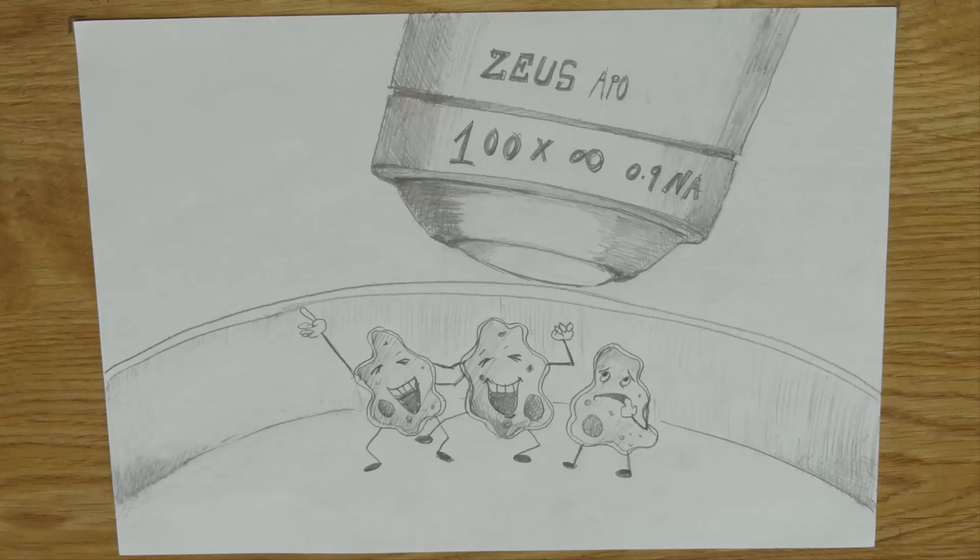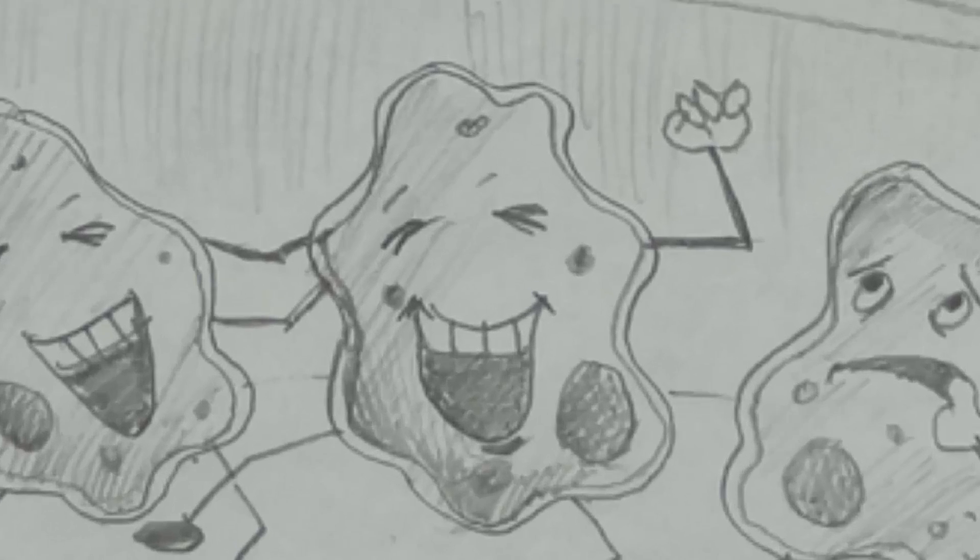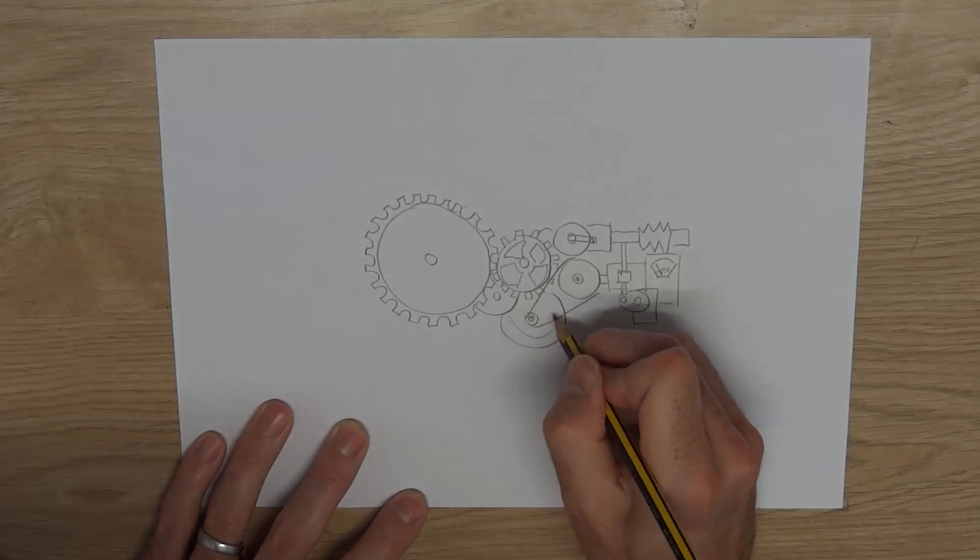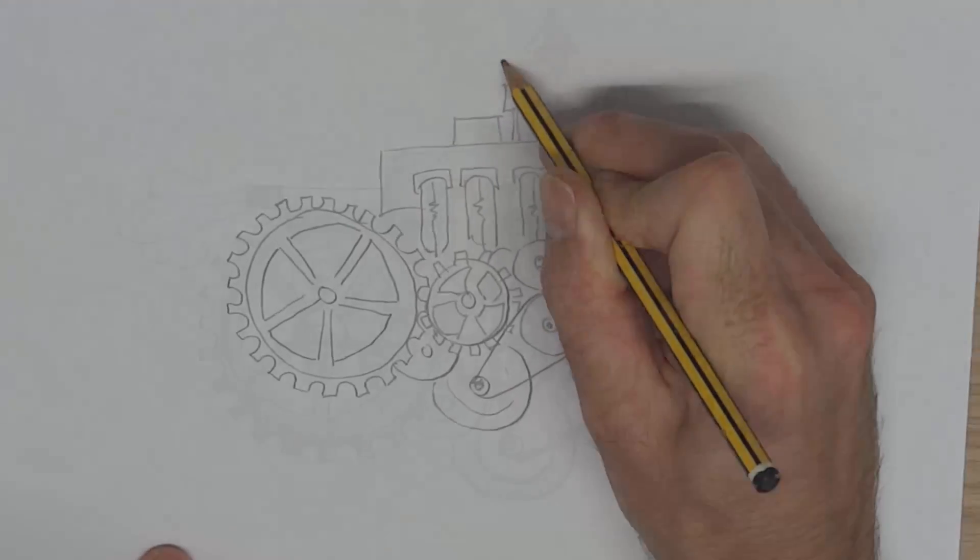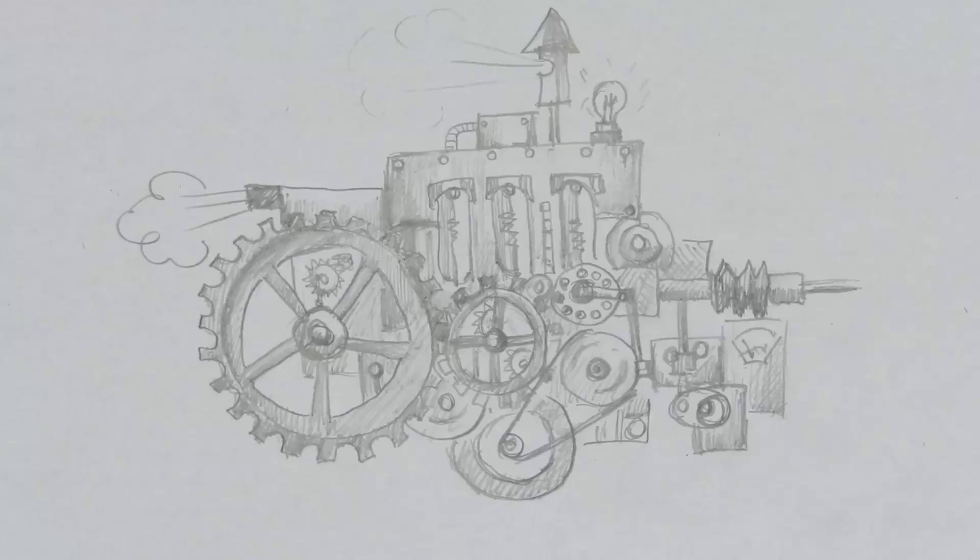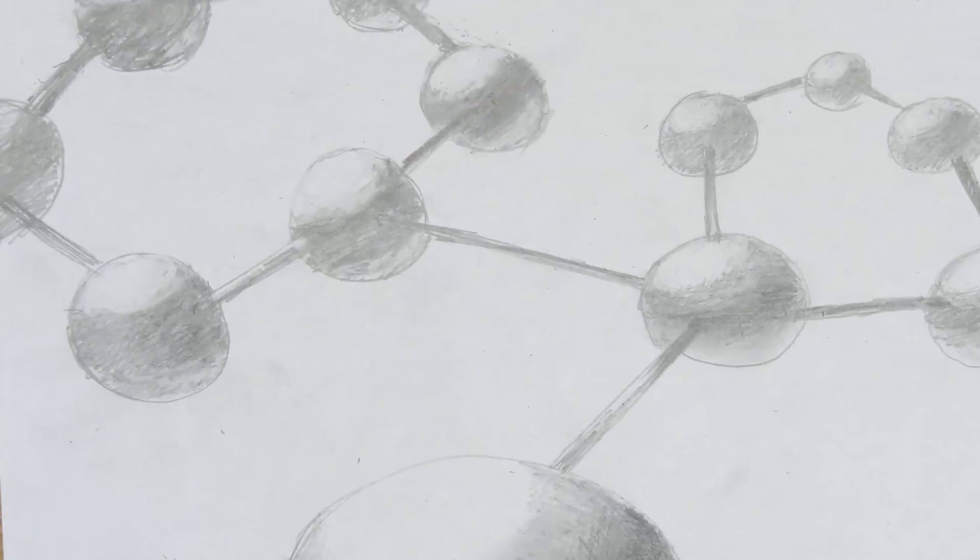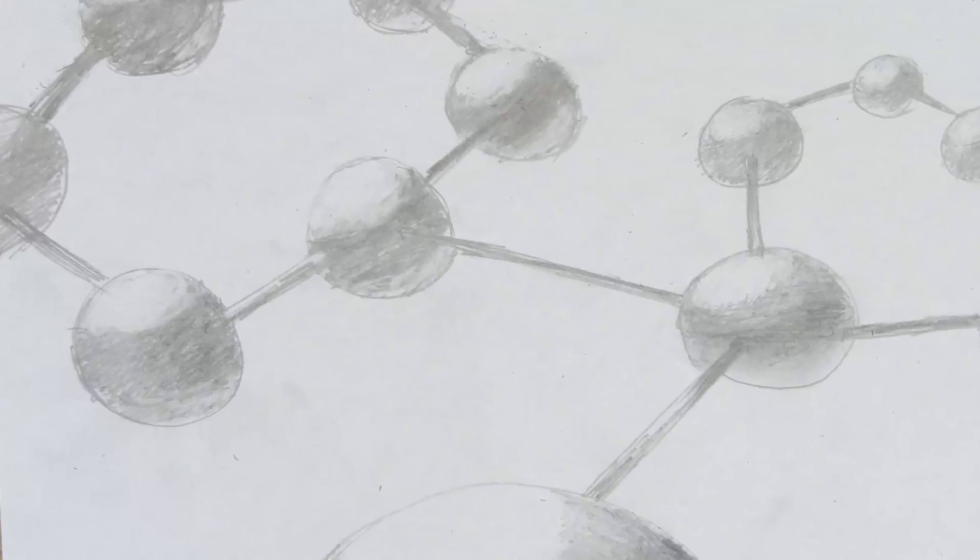Of course we can see these interactions taking place using light microscopy and increase magnification further to look right into the cell to see the machinery at work. In fact, using electron microscopy we can zoom in even further still to see how the machine is put together.